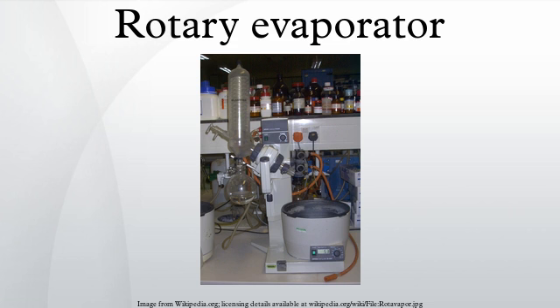Theory: vacuum evaporation is a class of evaporation because lowering the pressure above a bulk liquid lowers the boiling points of the component liquids in it. Generally, the component liquids of interest in applications of rotary evaporation are research solvents that one desires to remove from a sample after an extraction, such as following a natural product isolation or a step in an organic synthesis. Liquid solvents can be removed without excessive heating of what are often complex and sensitive solvent-solute combinations. Rotary evaporation is most often and conveniently applied to separate low-boiling solvents such as n-hexane or ethyl acetate from compounds which are solid at room temperature and pressure.